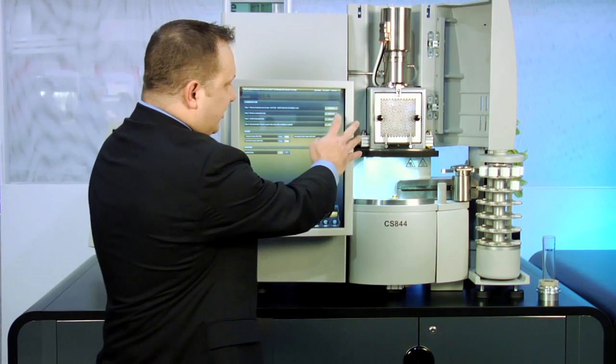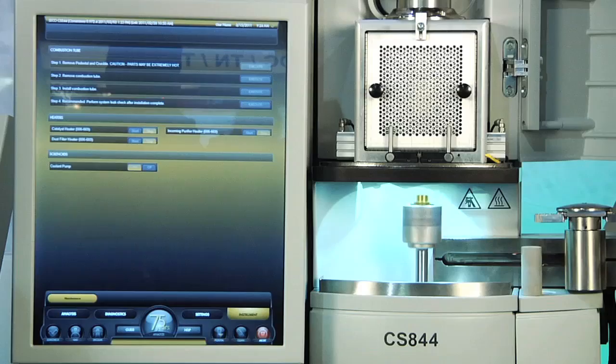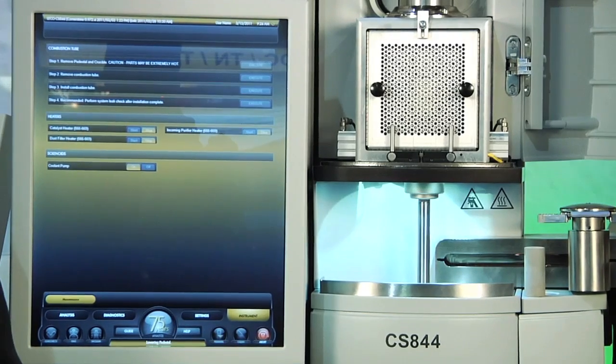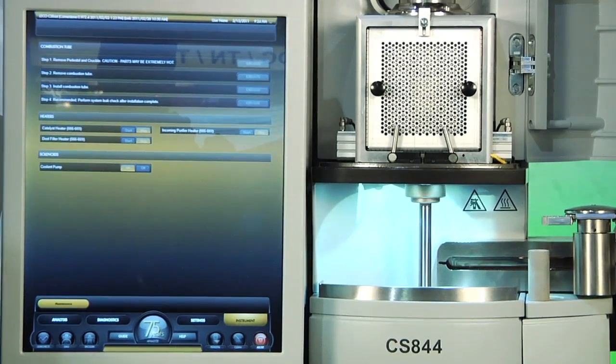The second would be to remove the combustion tube itself with a single execute command. This will raise the pedestal, disengage the combustion tube housing.